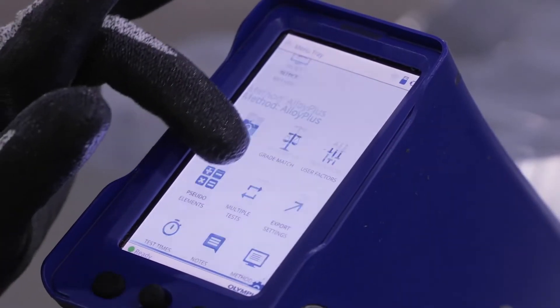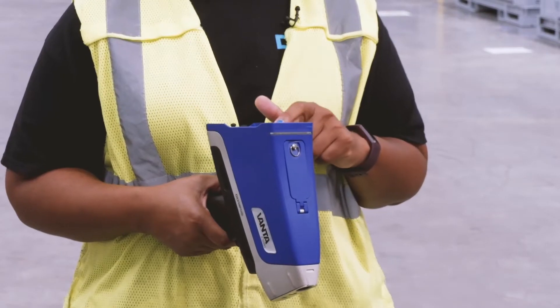Training for XRF was really easy. It took about a day. The analyzer is really easy to use — it's very similar to operating a cell phone.